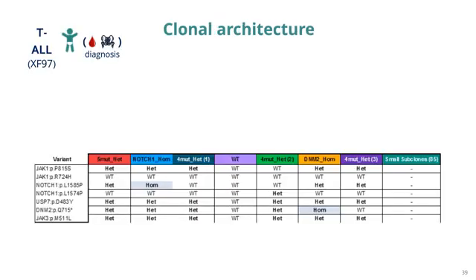So with this, I would like to show you 3 examples about the clonal architecture in 3 different patients. The first one, I will start with an example at diagnosis only. So how is the leukemia at diagnosis?